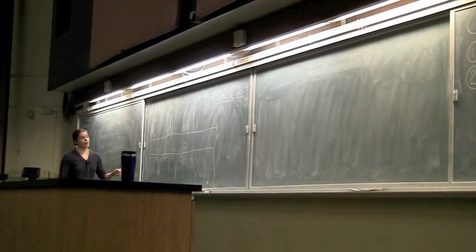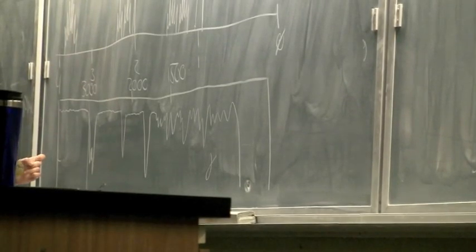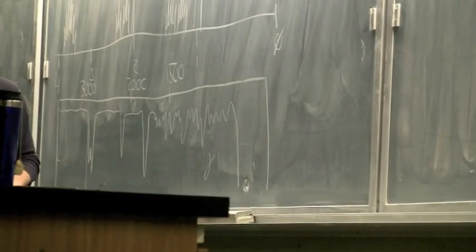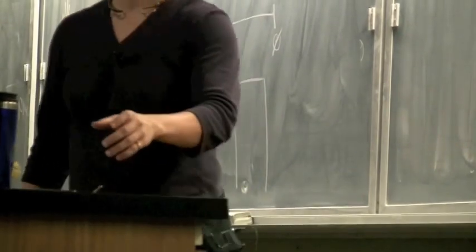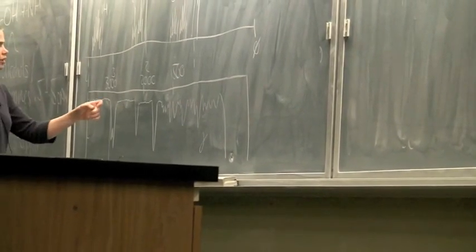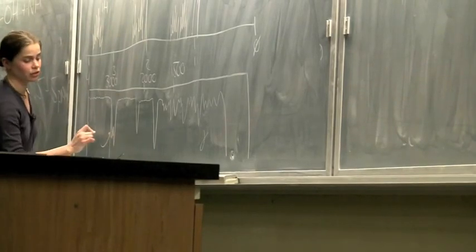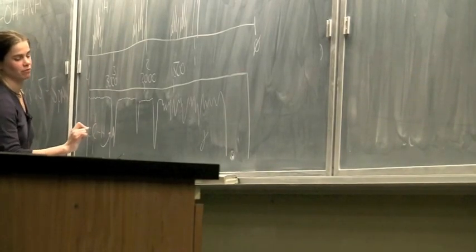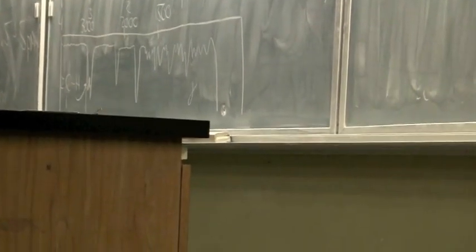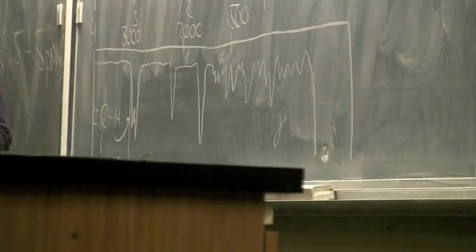And if we look at this IR, we're coming along, and we don't see anything significant really in that zone 1. We don't see anything that's an OH, we don't see anything really that's an NH, well, we didn't have any nitrogens in the first place, so that's probably not a big thing. But we don't see any pi bonds, we don't see any alkyne hydrogens. What we do see is just regular old CH. So there's our reference point. There's nothing to the left of it, so there's no alkenes or alkynes or OHs. We don't see that spike just to the right, that's an aldehyde. We've just got CH.